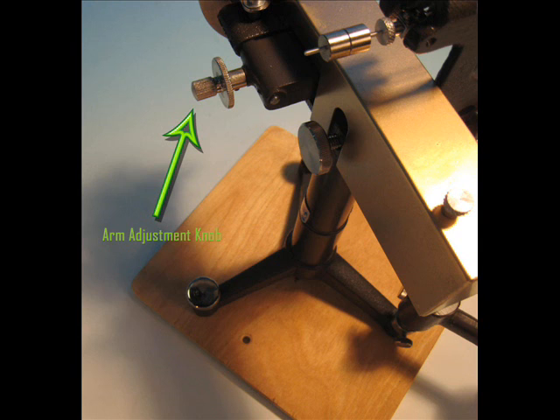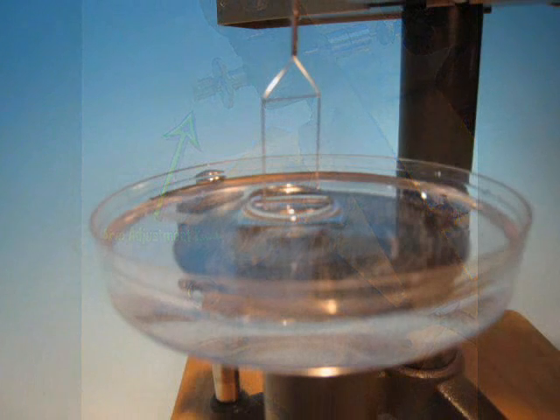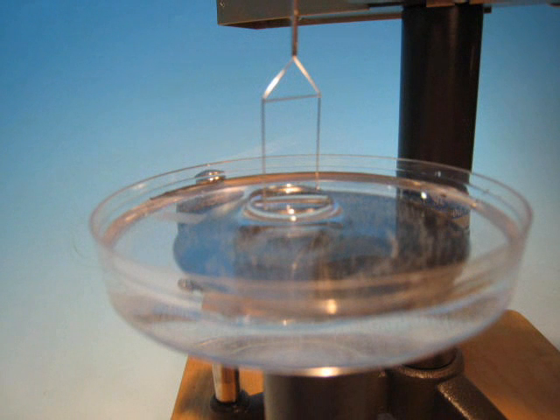Repeat this process of slowly lowering the sample until the pointer moves below the mirror line and moving it back to the mirror line with the arm adjusting knob. With this process, the ring slowly pulls through the liquid surface creating a meniscus.